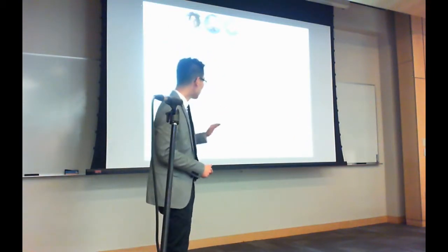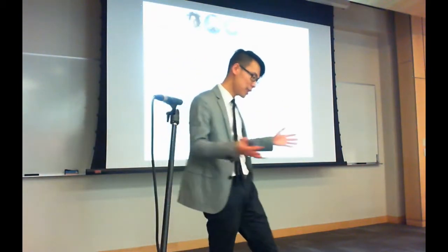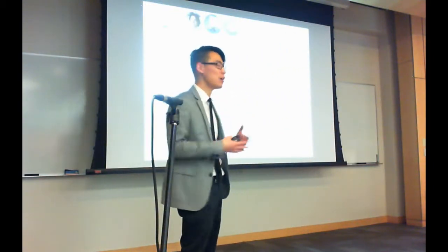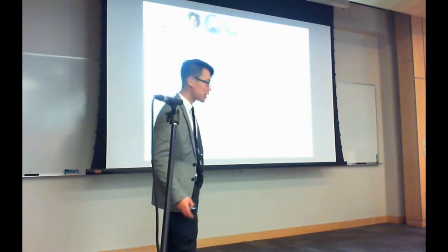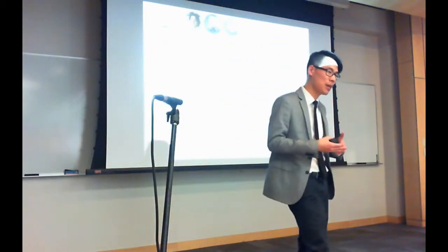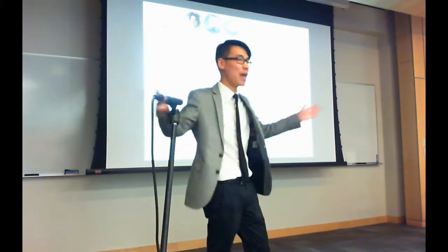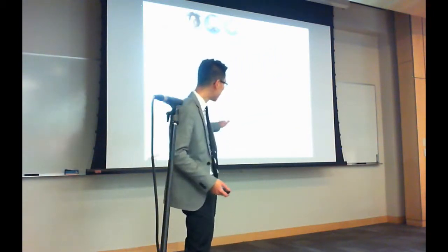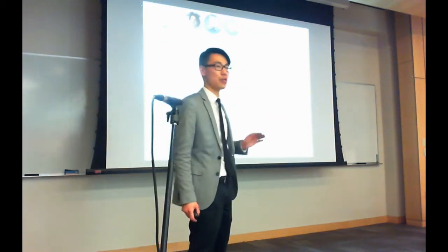Also, we will need to address library level FDR. Once you put everything together, how do we start controlling for the error when we have so much data together? All the true identifications, the good spectra and the good peptides, are observed many, many times, and they'll still be observed many times correctly. But all the false identifications are randomly splayed out. If you do not control this appropriately, you can have an unacceptably high false discovery rate in your particular library.